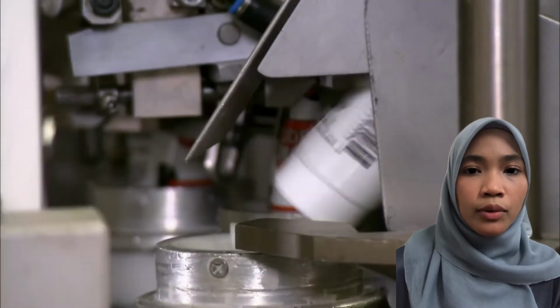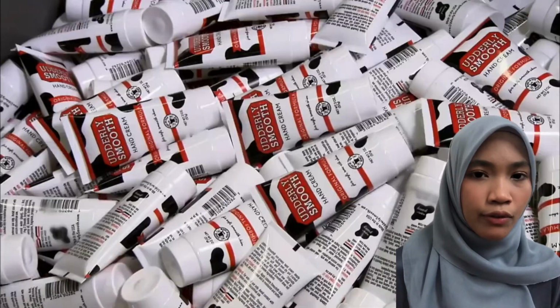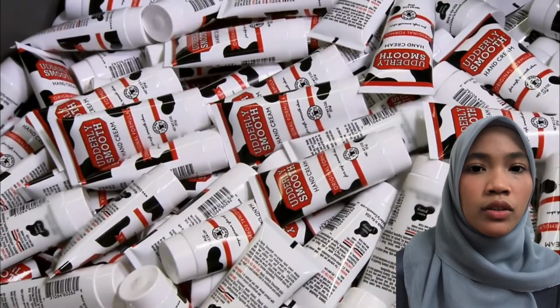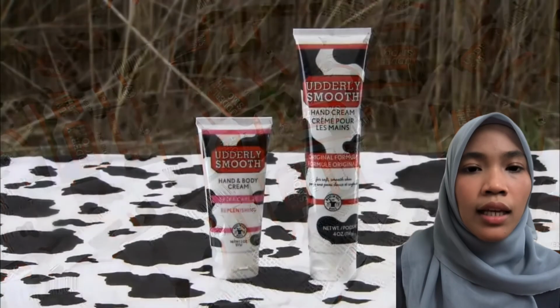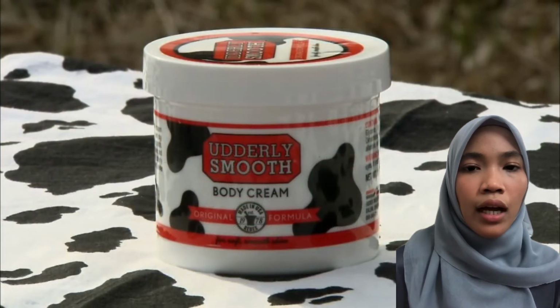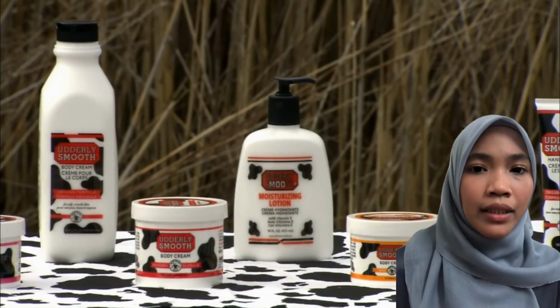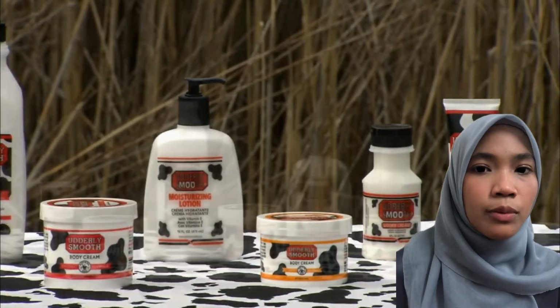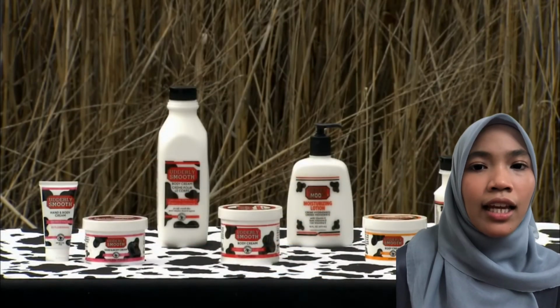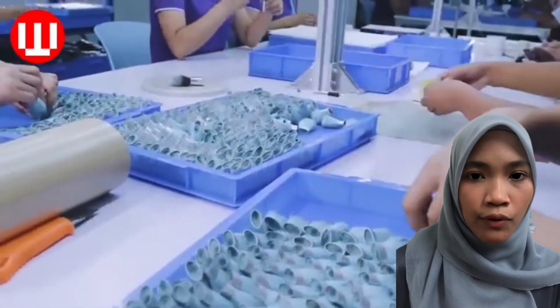Another point I want to bring up is the type of stationary phase and mobile phase or solvent that you choose when making cosmetic products. As expected, the materials selected for isolation of natural product by chromatography depend on the type of compounds present in the extract and the extraction process used prior to the purification.